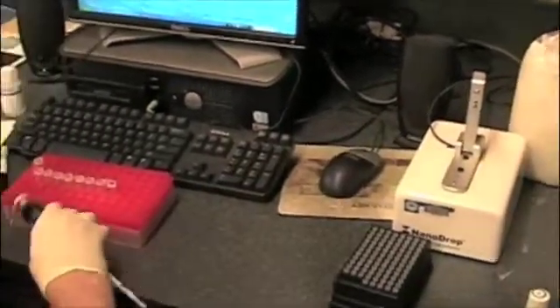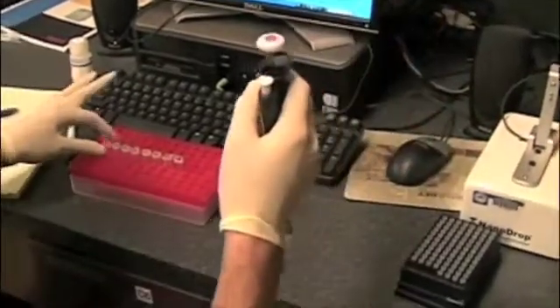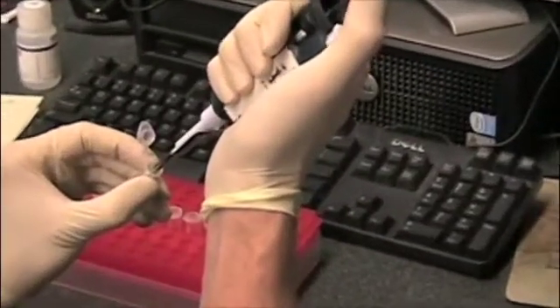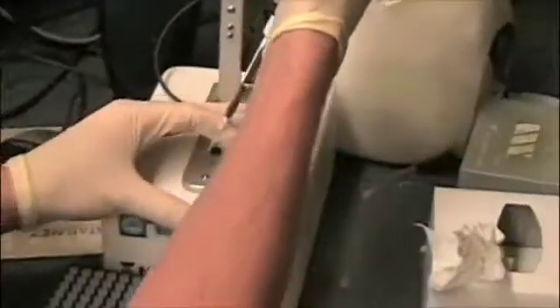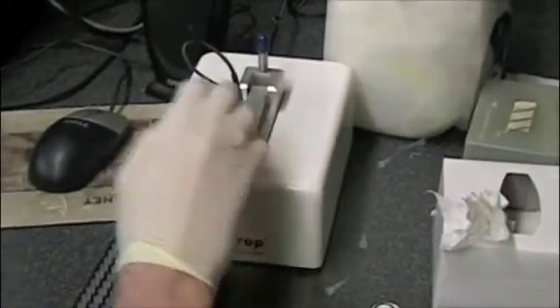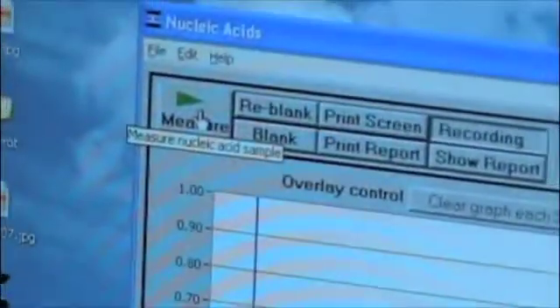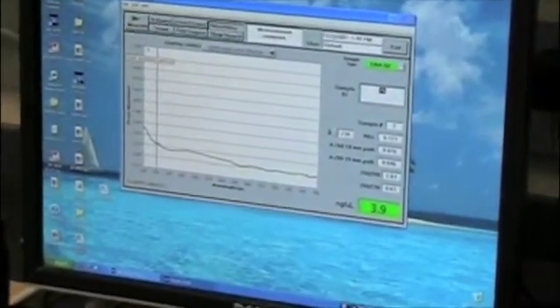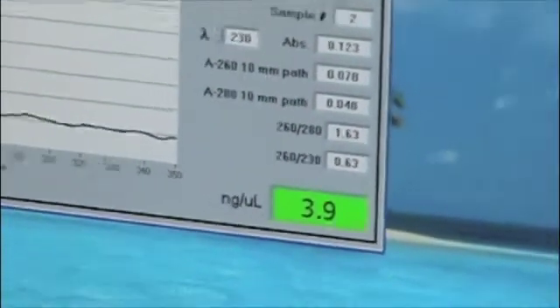Let's do one more for the video. Jonathan will continue with the remaining samples off tape. Pick up one and a half microliters and place that on the drop. It's important not to get any bubbles in that drop when it's on the bead, otherwise you'll get faulty measurements. The new sample is changed to 75, then simply click measure. 3.9 nanograms per microliter — not a terrible amount, not a terribly high amount of DNA, but some. On to sample three.